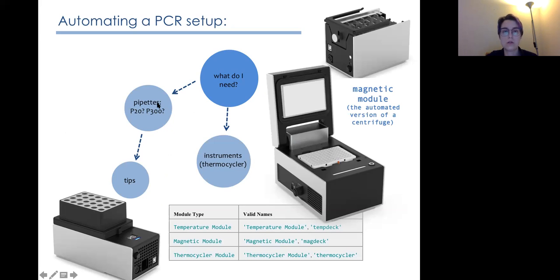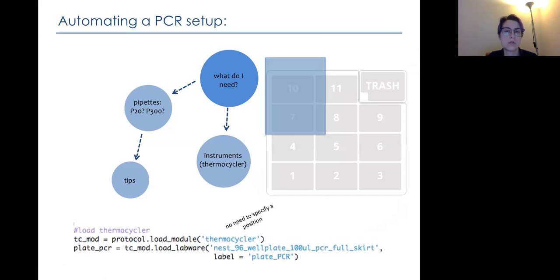So here, other than pipettes, we can also have some instruments. OpenTrons is giving more and more instruments. These are the modules that were available at the time we bought it. This is a magnetic module, this is a PCR machine, and this is a thermoblock. Now they probably made another one, and they're probably making other 3.